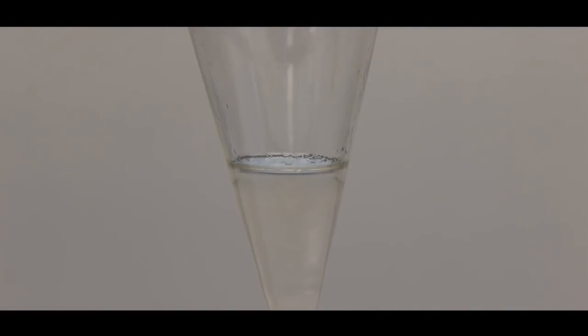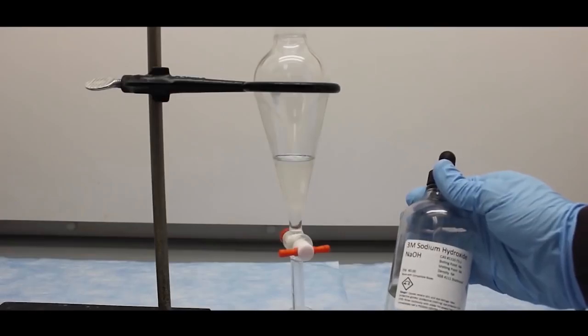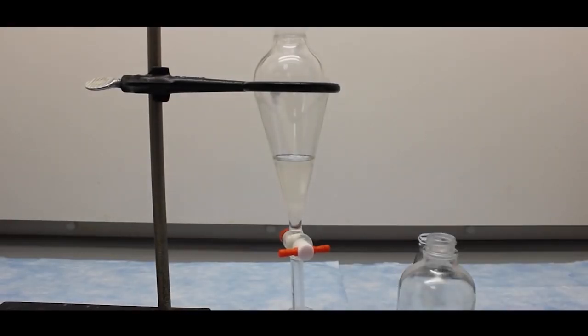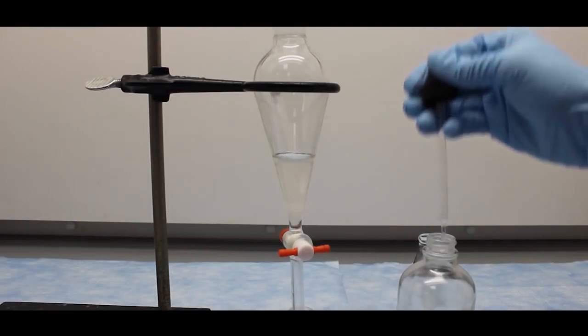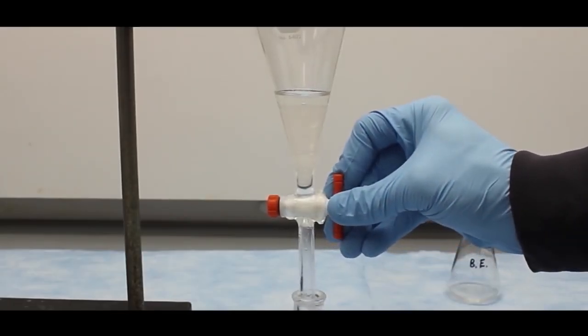You can sort of see two layers on the sides of the sep funnel, but not in the middle. I'm going to add some more 3 molar sodium hydroxide to see if I can get the layers to be more noticeable. Now I will drain off the bottom neutral DCM layer.